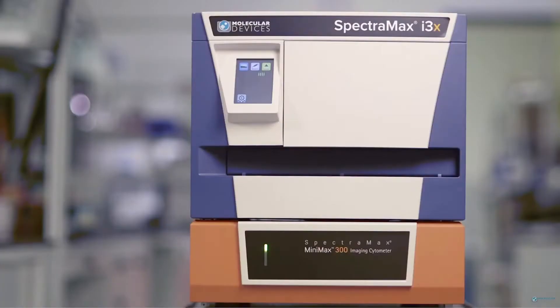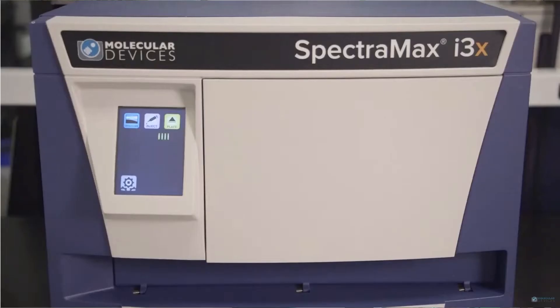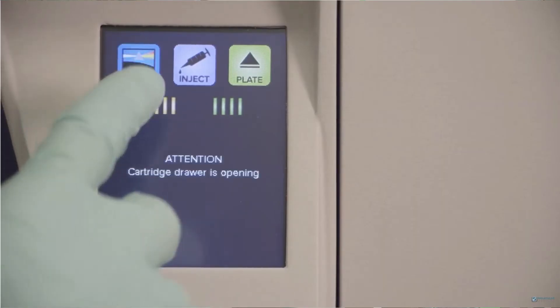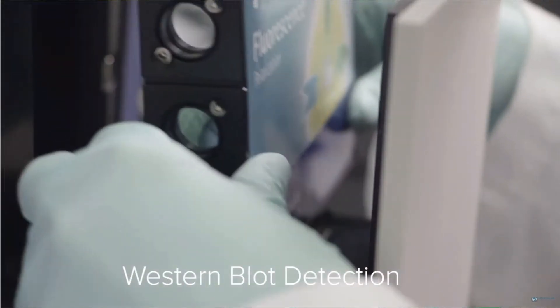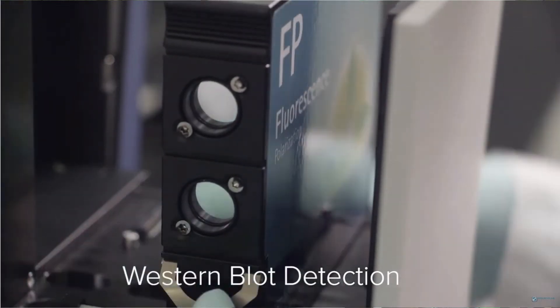A lot of our customers don't know what kind of assay they are going to run tomorrow and they are concerned about purchasing an oversized instrument. The i3X has a unique capacity for adding new reading modes through a cartridge system, which allows you to upgrade your reader in less than 20 seconds.